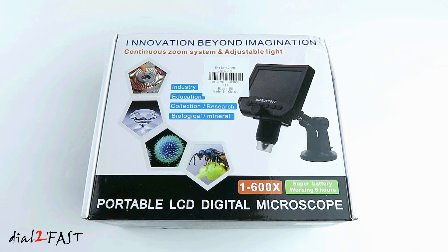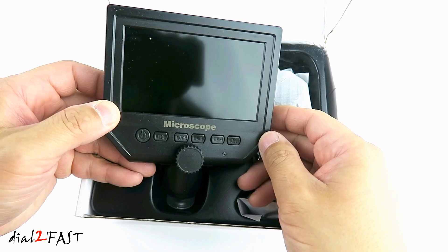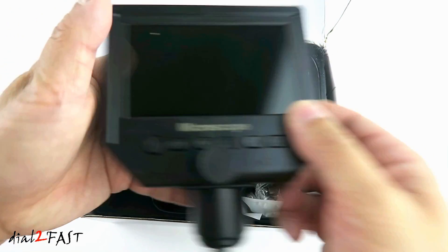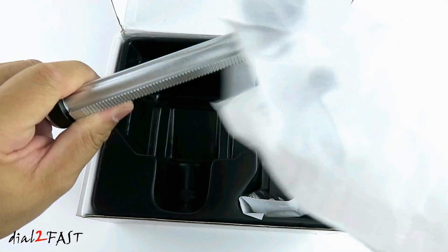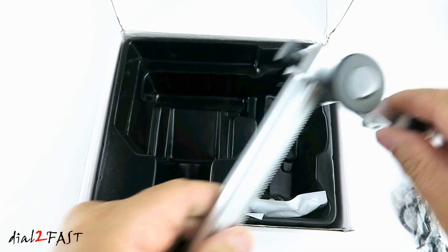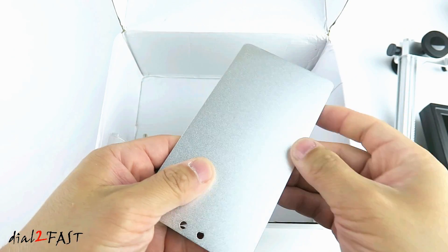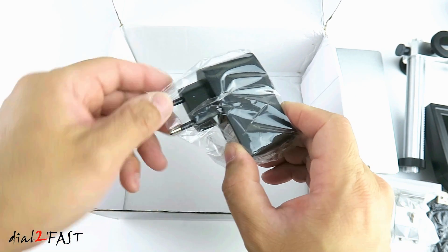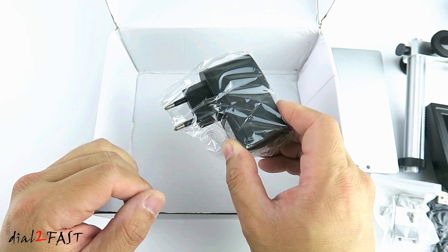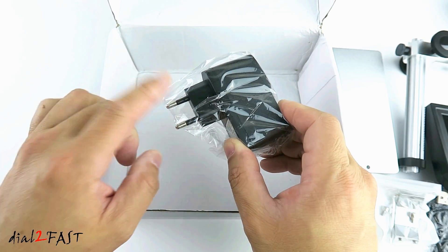So let me unbox this and I'll show you what comes with this unit. Here's the microscope unit, USB cable, metal stand, and metal base. This is a USB charger with the EU plug, but you can use any USB charger to charge this microscope. If you want to use this charger in the US, you will need to get an adapter for the plug.